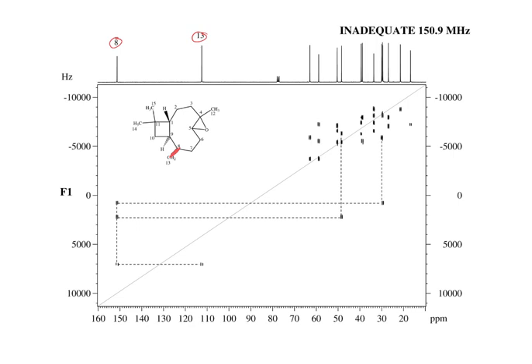I think the NMR guy down at University of Utah had this program. They ran it such that the peaks that were coupled would be offset in phase, and he had this program that could search through the data to pick out these offset peaks, even though they were almost in the noise.